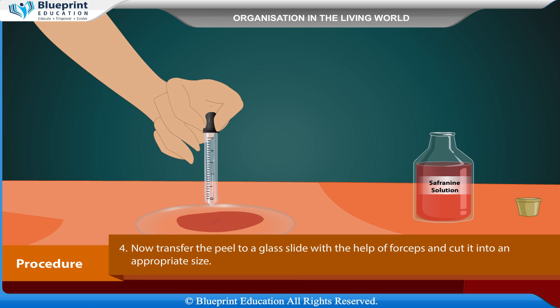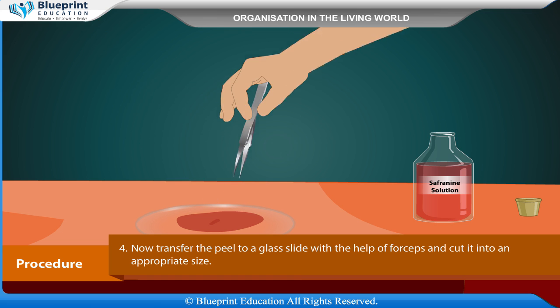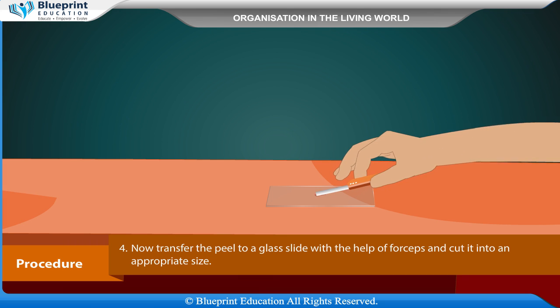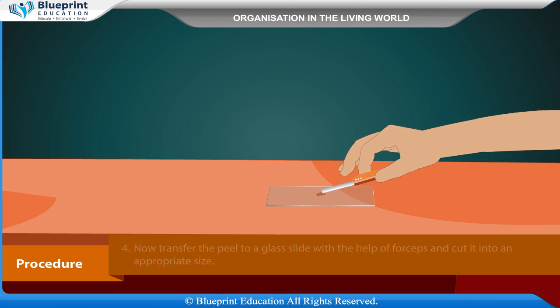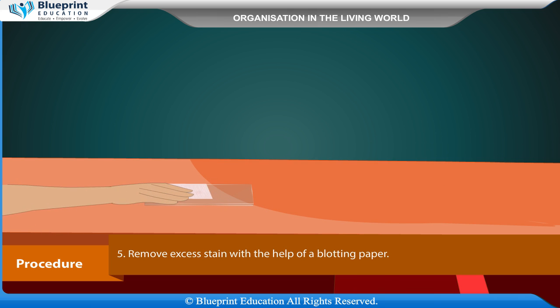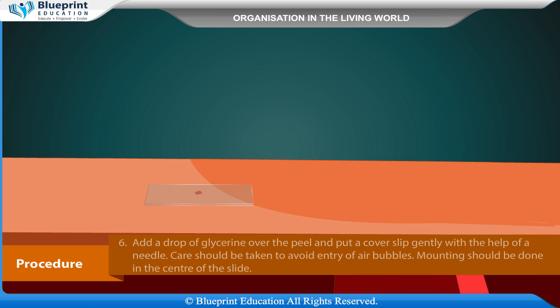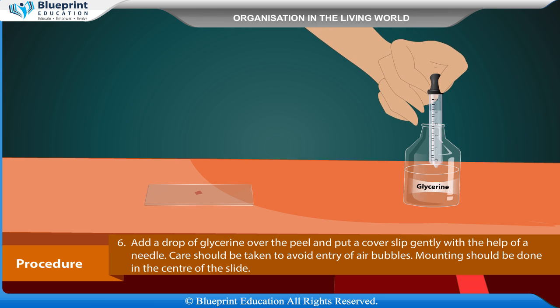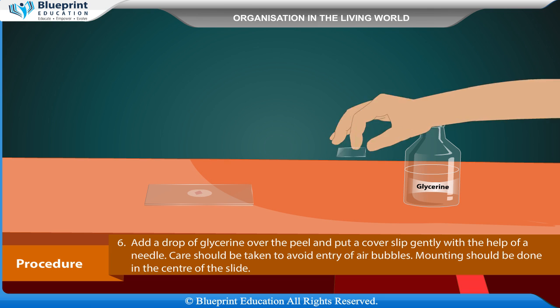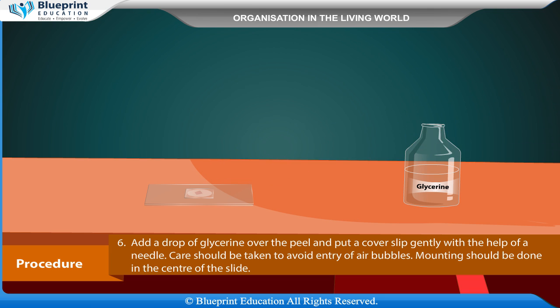Transfer the peel to a glass slide with the help of forceps and cut it to an appropriate size. Remove excess stain with the help of blotting paper. Add a drop of glycerine over the peel and put a cover slip gently with the help of a needle. Take care to avoid entry of air bubbles.